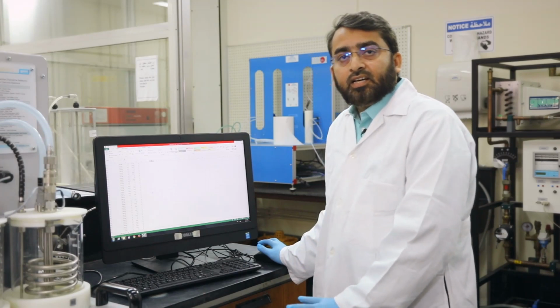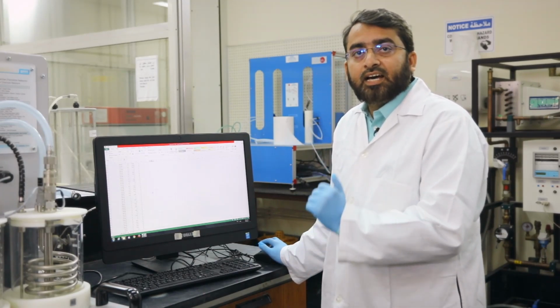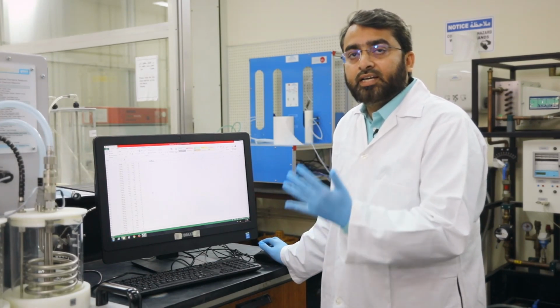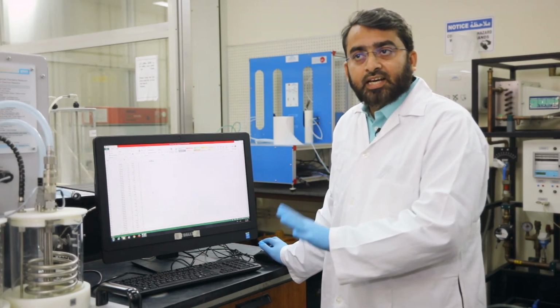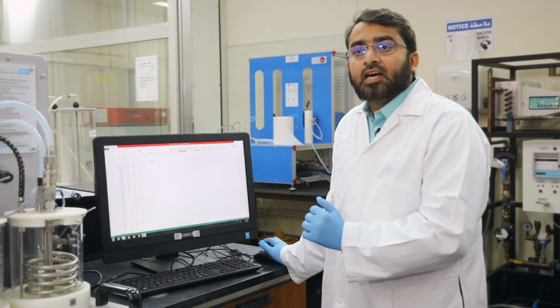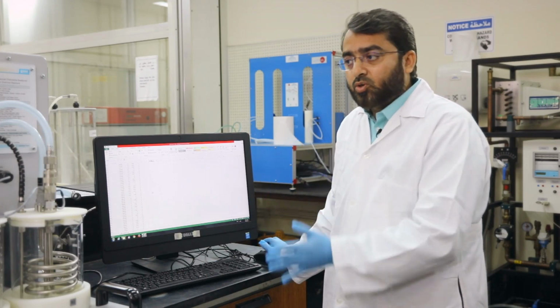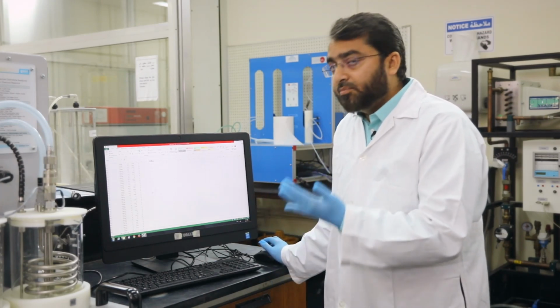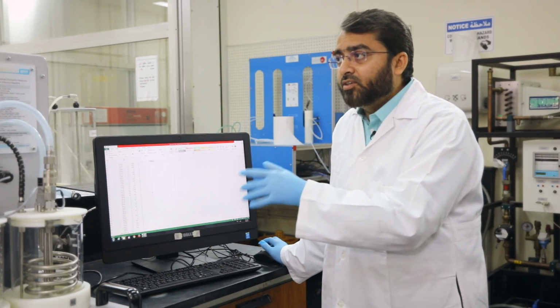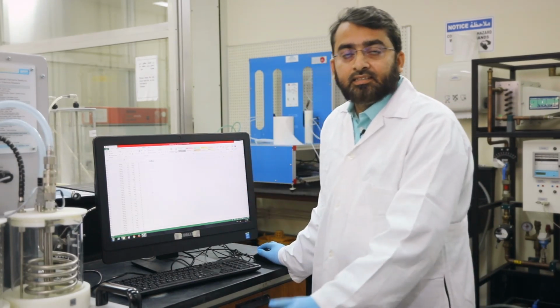Later you can fit the first order equation or second order equation and find which order fits better, and decide that this is a second order reaction. Then find the rate constant using the slope, and you will repeat the same for the data given to you at higher temperature. Okay, that's it. Thank you.